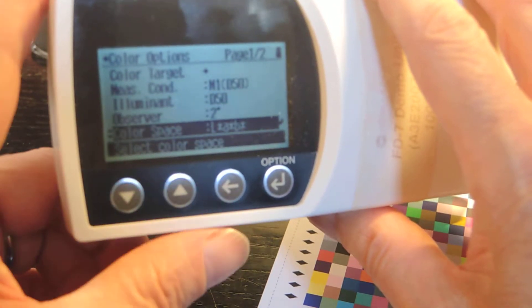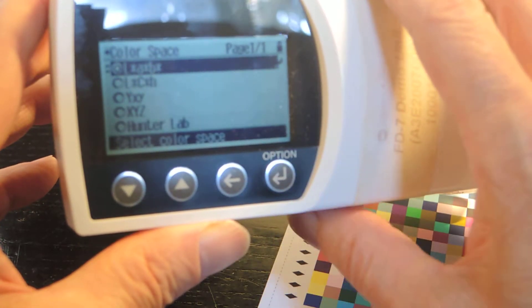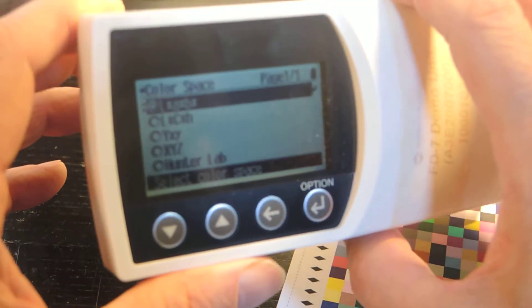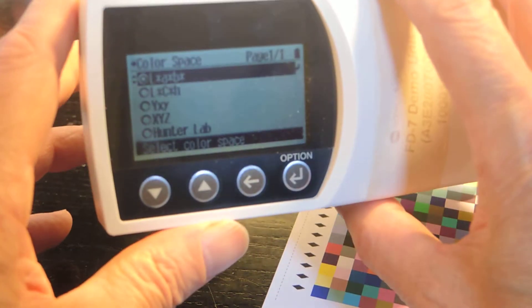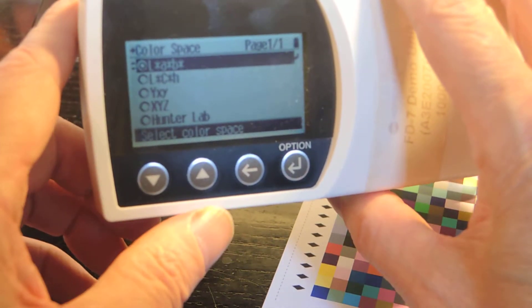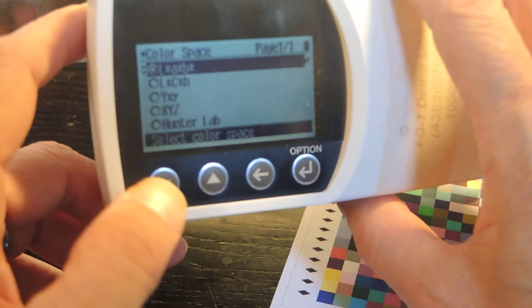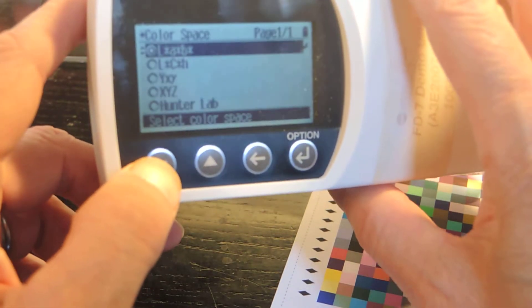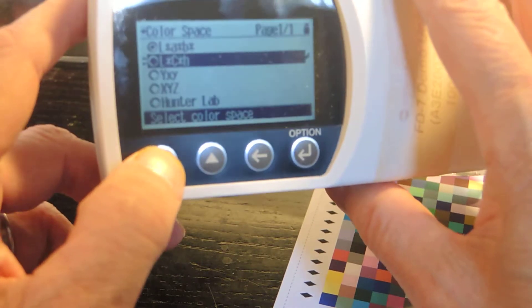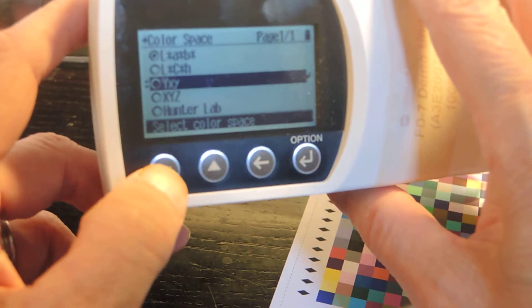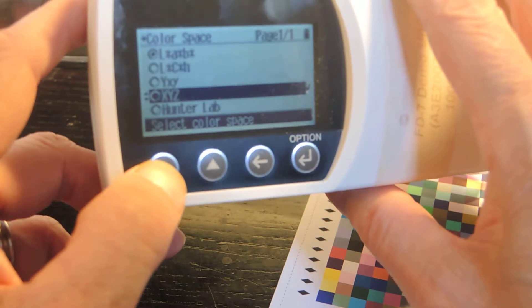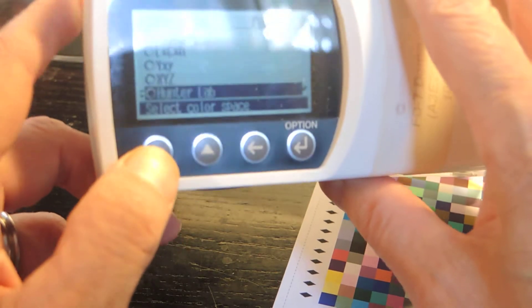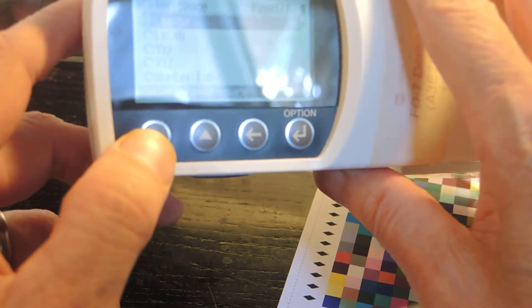This is the color space menu. What do we see? Option. There we go. So these are all the color spaces that are supported by the camera, which means the first one at the top is LAB. The second one is LCH. Third one is YXY, that's for chromaticities. There's capital X, Y, Z. Then there's Hunter Lab. And that's it.